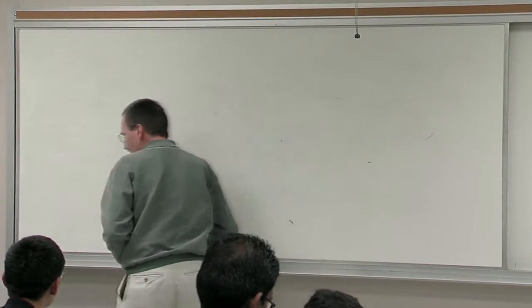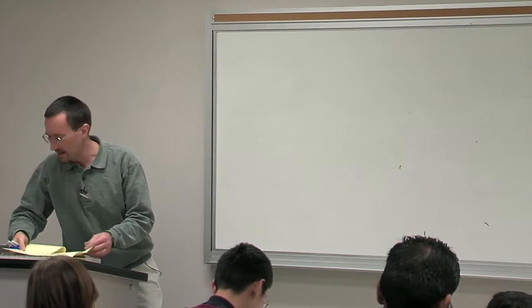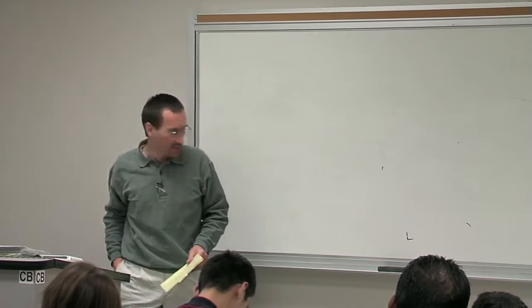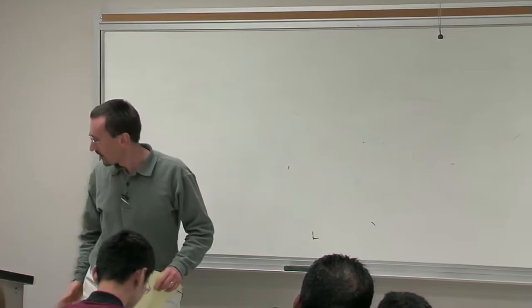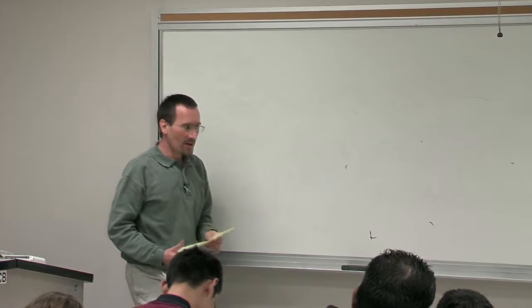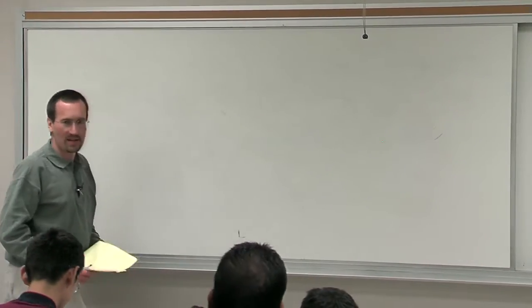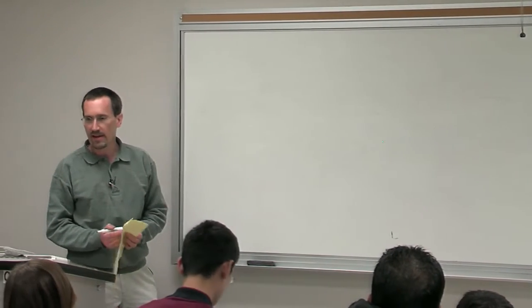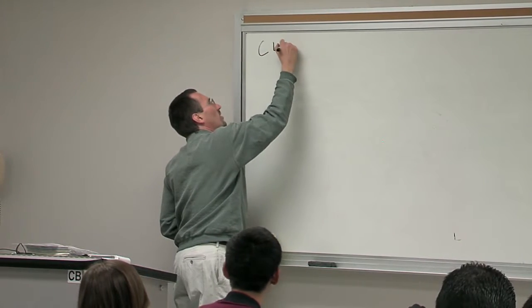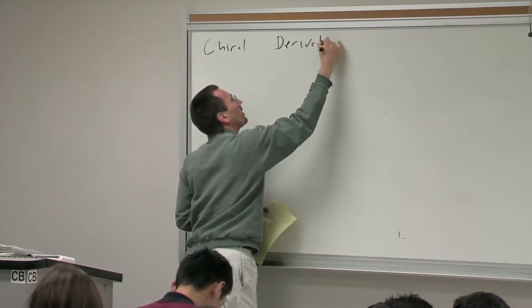All right, so chirality is a real problem for NMR because, as I said, NMR is not inherently able to tell enantiomers apart. You've got to do something to distinguish among enantiomers. So another way to go, and I'll say another way because there are lots of clever ways, including ways being developed in the Rychnovsky group right now, and that have been published out of the Rychnovsky group. But another way that's been used for a very, very long time is chiral derivatizing agents.